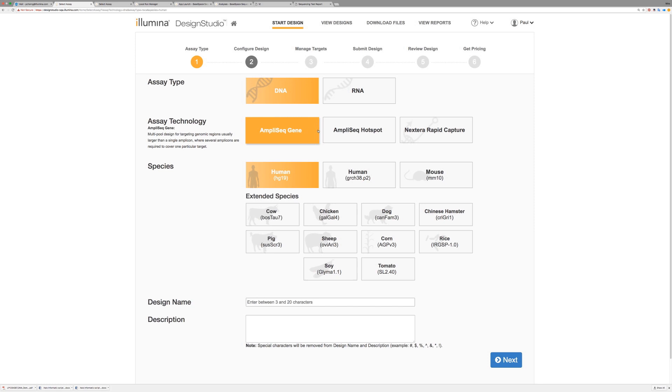Then, select the species you're working with. In this case, we're choosing Human, but you have many different options. Name your design, and if you'd like to, you can add a description.